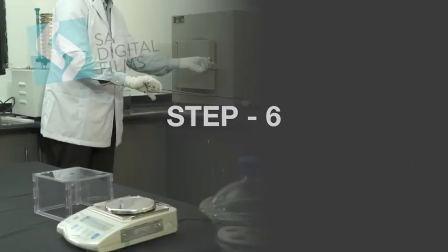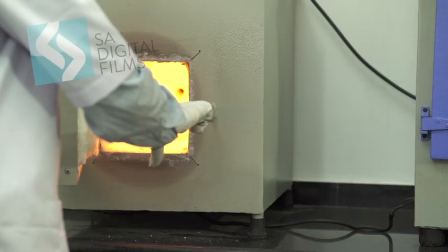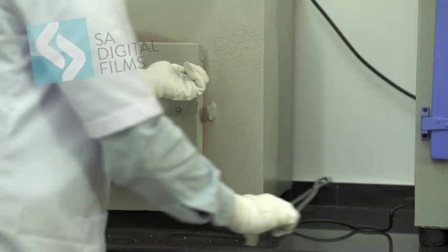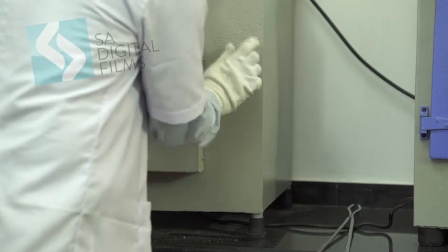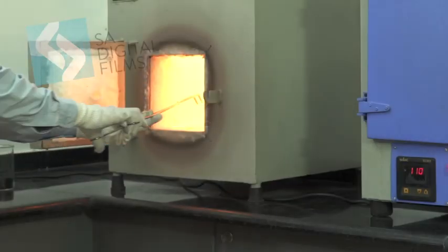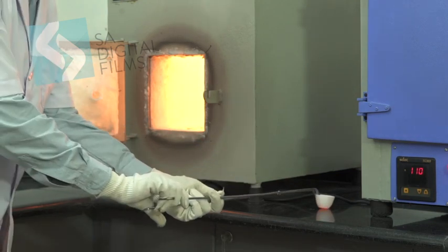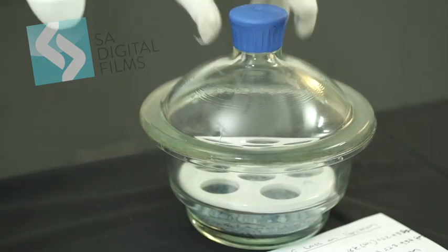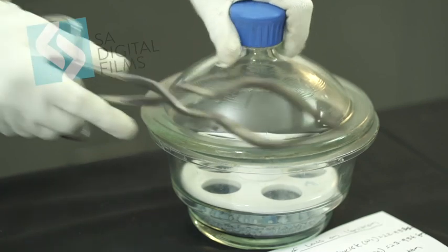Step 6. Put the silica crucible with sample in the muffle furnace for 2 hours at 920 plus or minus 10 degrees Celsius. Stir the mass in between so that the sample can be completely incinerated. Step 7. Take out the crucible from the furnace using a tong and let it cool down for 15 minutes at room temperature. Step 8. Then cool down the crucible in the airtight desiccator which contains anhydrous silica gel for 10 minutes.